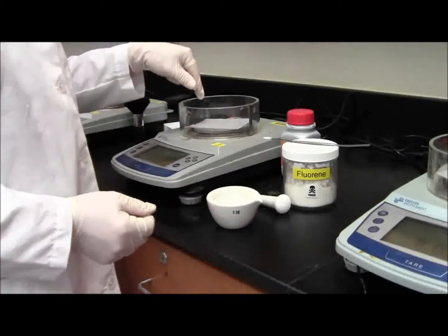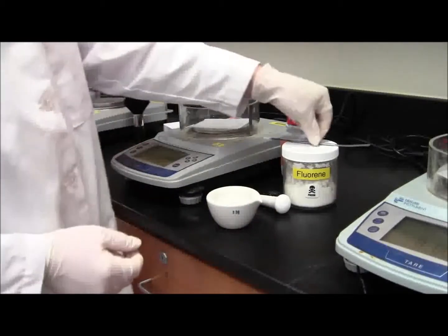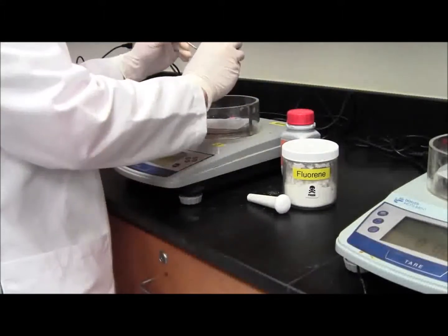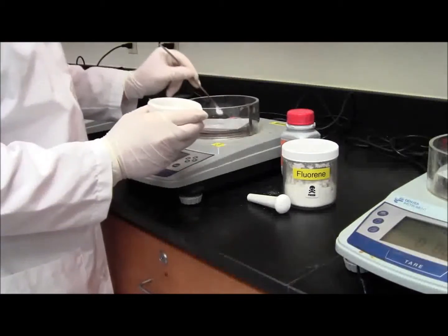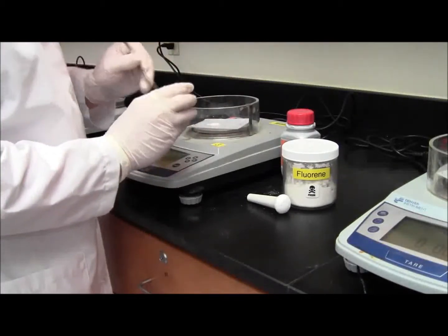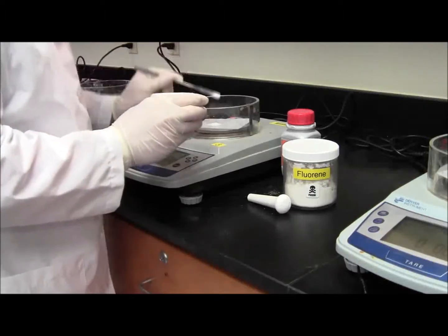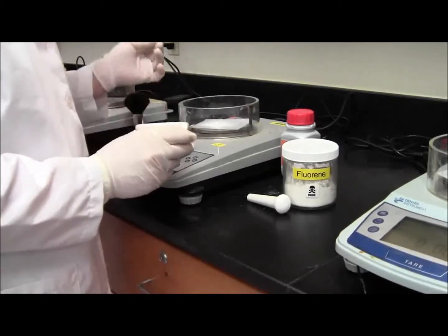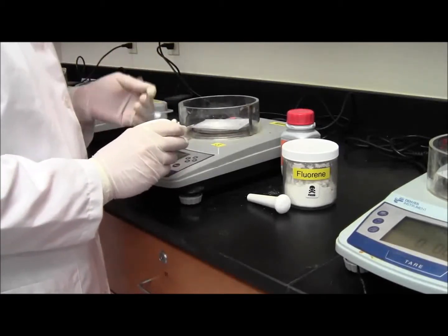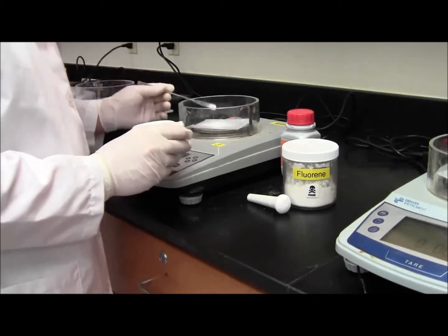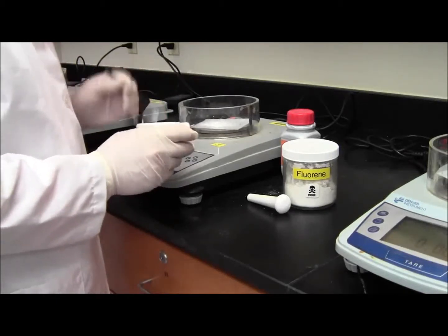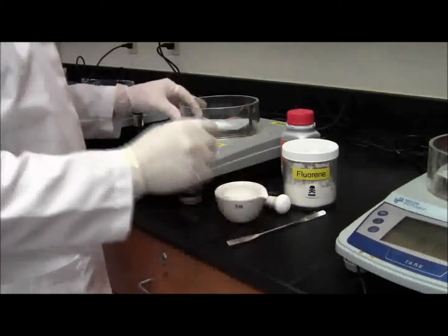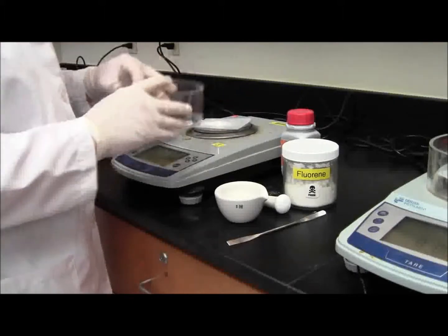Put the weighing paper back on the scale. Tare it again and weigh out 0.95 grams. There I got 0.959. This will be used for the crystallization.